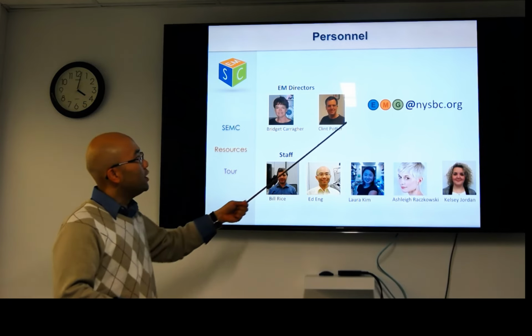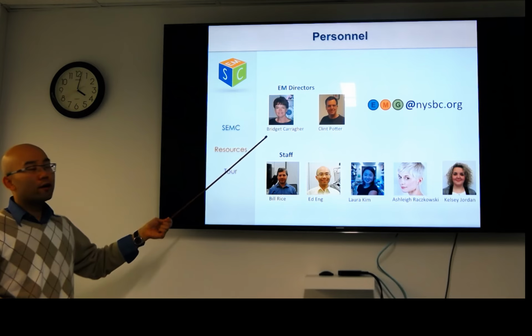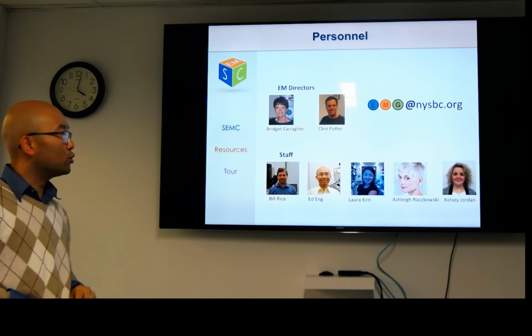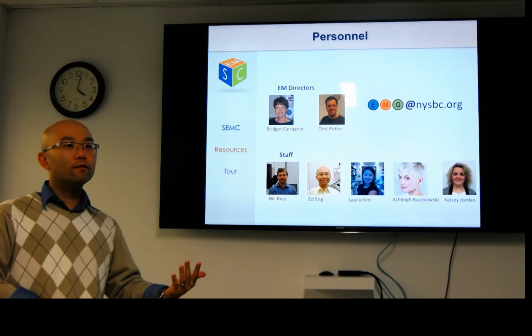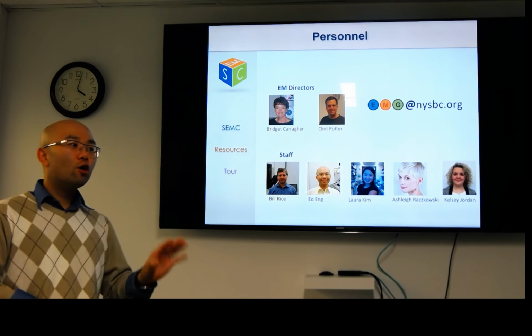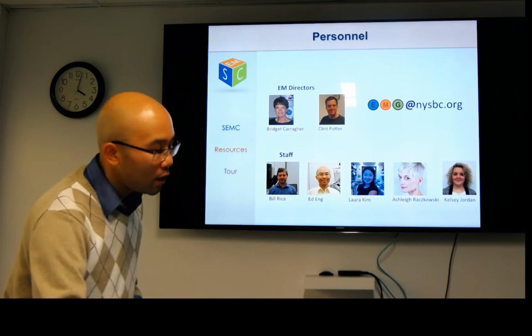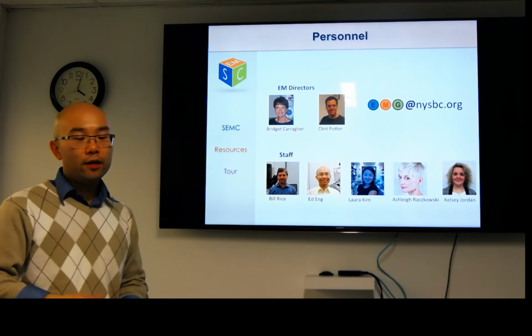Us refers to emg@nysbc.org. Our EM directors, co-directors are Bridget Carragher and Clint Potter, and I'm joined by very highly trained staff who can help you and move your research program forward. The reason I say research program is that I hope it won't be just a one-off, because very easily, if you have a sample, we can give you figures 1 and 2 of your paper. But what we hope is that you'll learn this technique and make use of it routinely. And many of the staff I've already outlined and showed you are going to be here teaching the course.